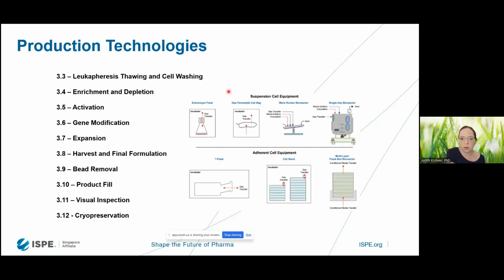Of course, we have the possibility to do that completely manually. We go into our isolator, the part that Stephen already discussed, add our beads, perform any shaking process, and then let them incubate. That's definitely a possibility. But when it comes to really adding the cells using specialized equipment, that's where we have seen differences in the sensitivity as well as in the composition.